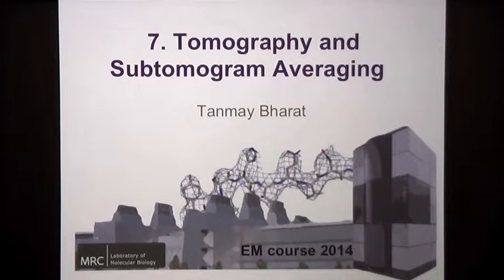Thank you very much, Shores. As Shores mentioned, we've had a few lectures on single particle analysis. Today I'm going to tell you about a very exciting application of electron microscopy, which is electron tomography.